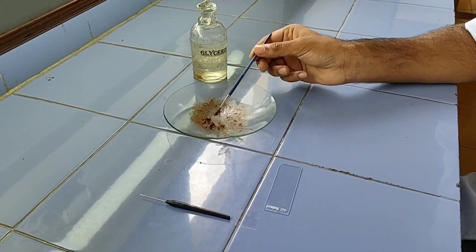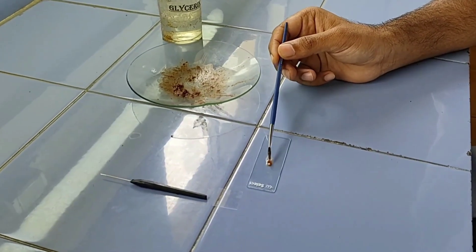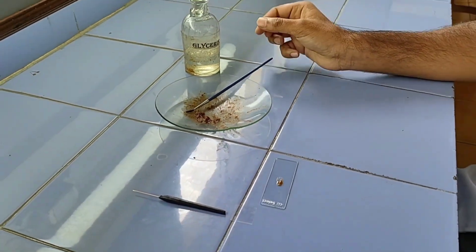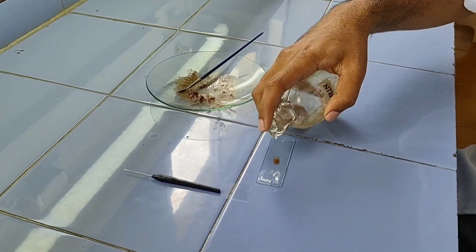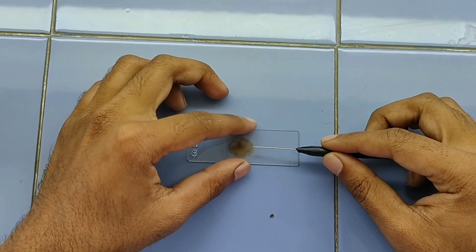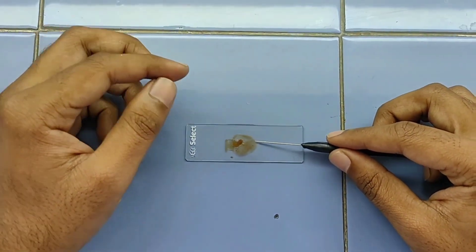After preparing the sample, carefully mount it on a plain slide and add a drop of Glycerin. With the help of a needle, place the cover slip and observe that there are no air bubbles.